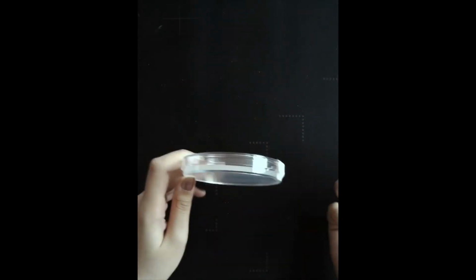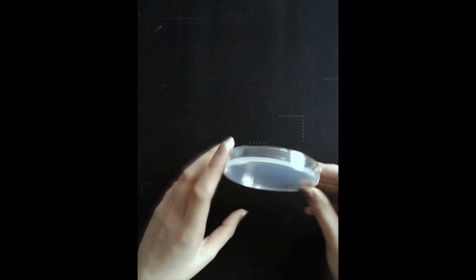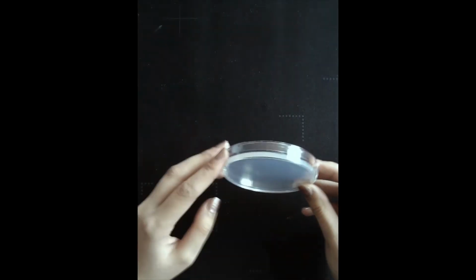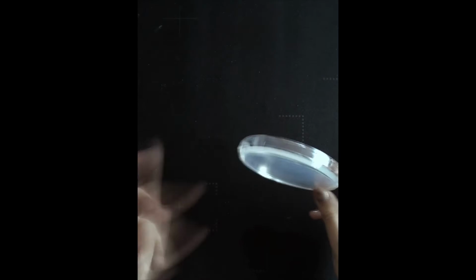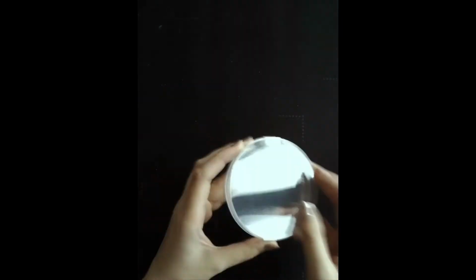In this lesson, we're going to look at culturing microorganisms, so growing microorganisms or bacteria in a lab. This is a Petri dish. Inside the Petri dish, there is agar jelly, which is a culture medium. So it's going to provide the bacteria with anything that it needs to grow, for example, carbohydrates, minerals, proteins, vitamins. Bacteria will form visible colonies.